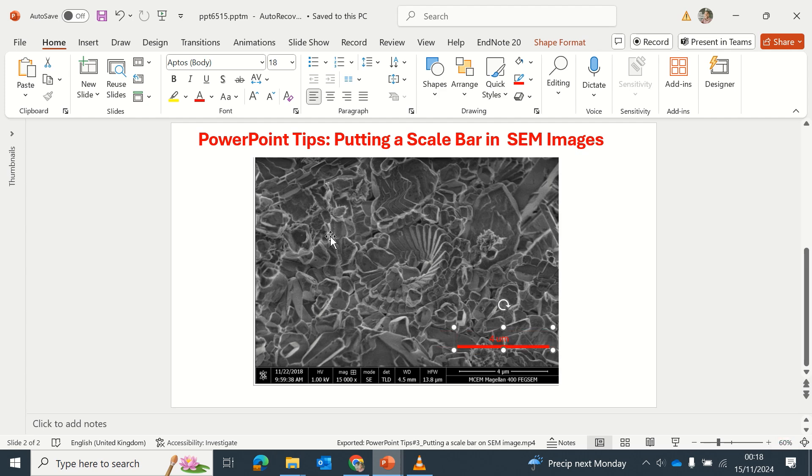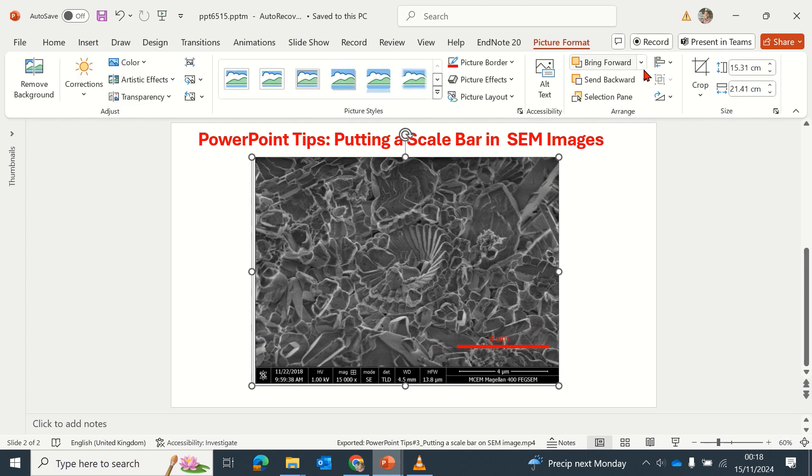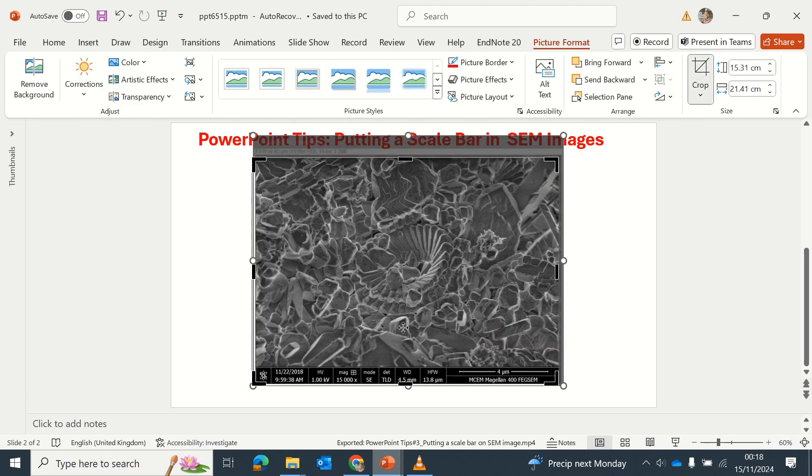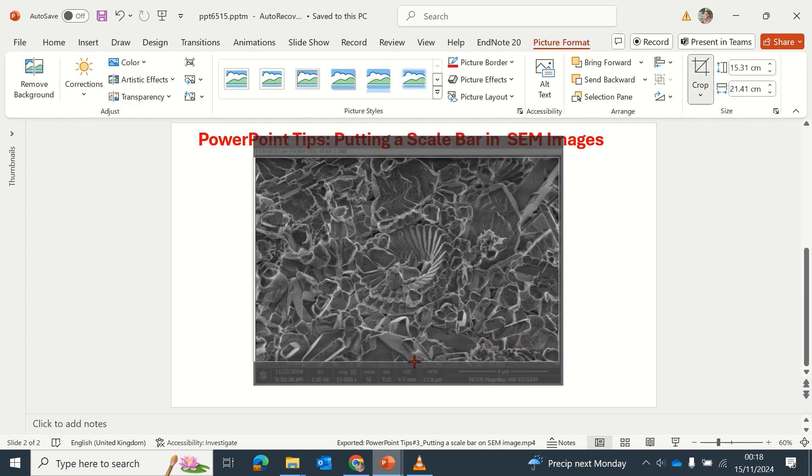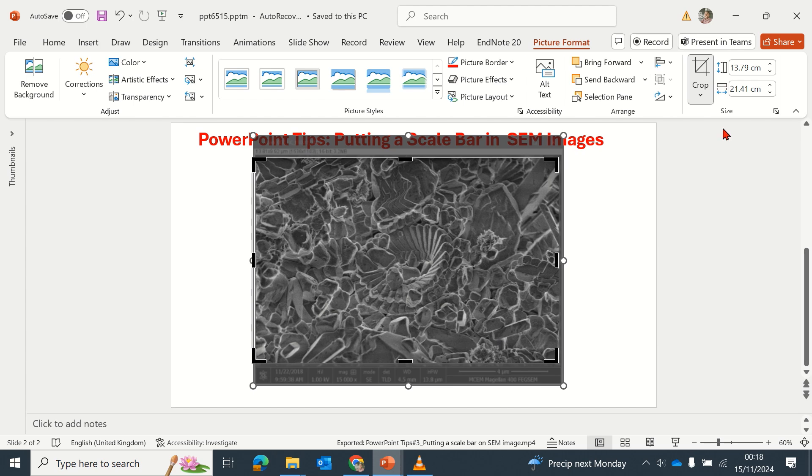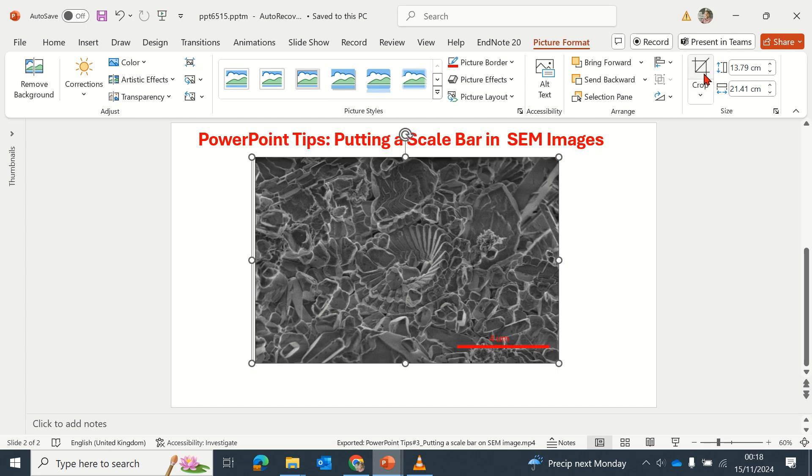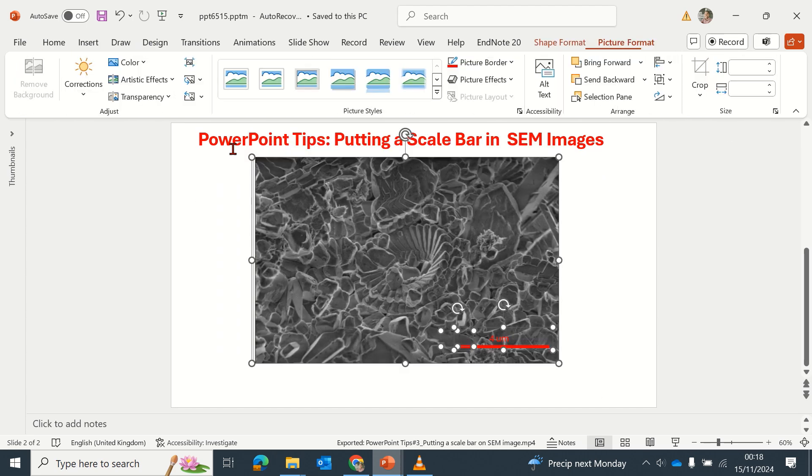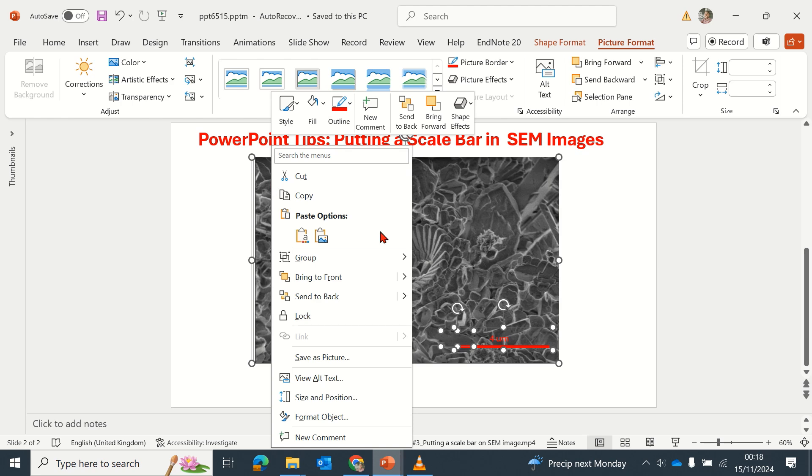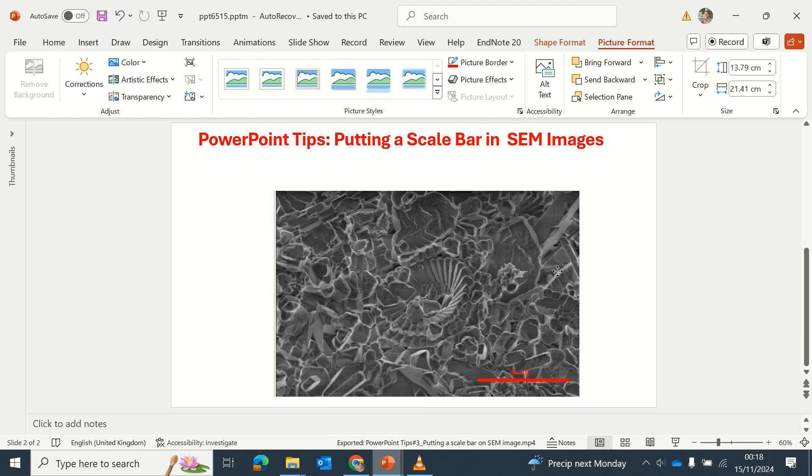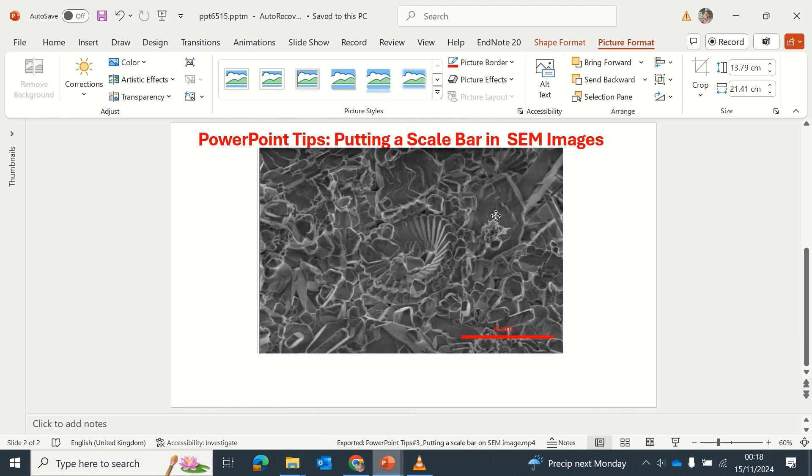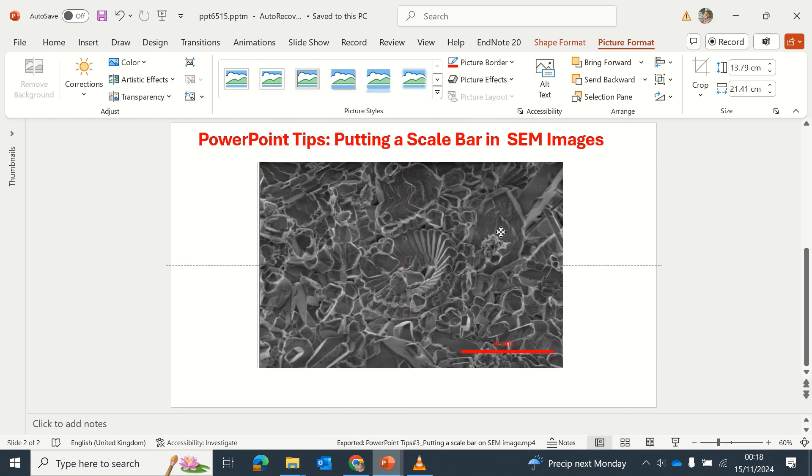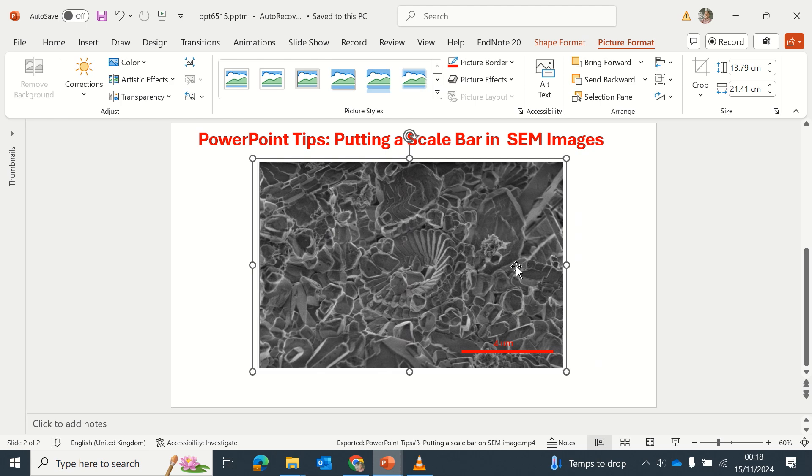Move it a bit, then you crop out this information. And then once I do that, I can group everything. There I have one single SEM image with a scale bar. This is the kind of image you will see in an article.